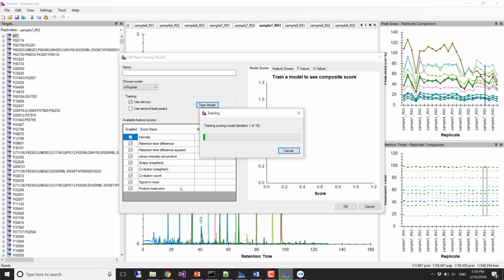So this is where it's doing linear discriminant analysis. Thankfully, it used to do 30 iterations of this no matter what, but now we look at it and decide when it's converging. It never does more than 10, because I found that the extra 20 didn't matter. So it goes a lot quicker. It converges after 5.